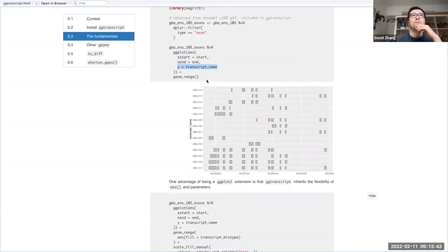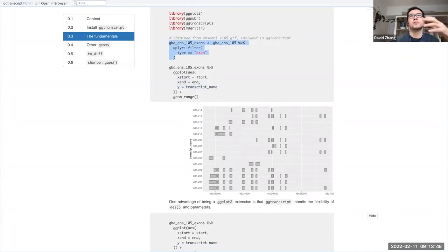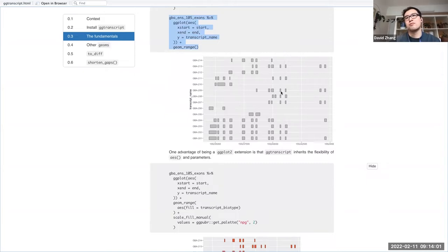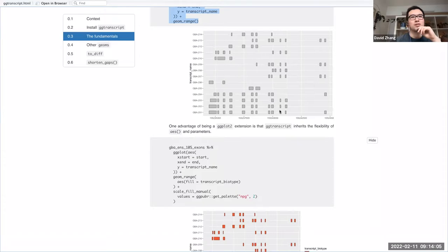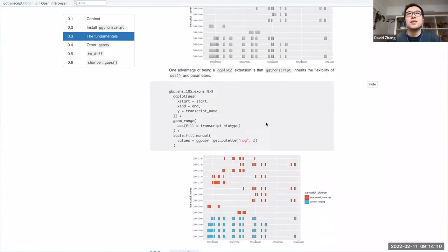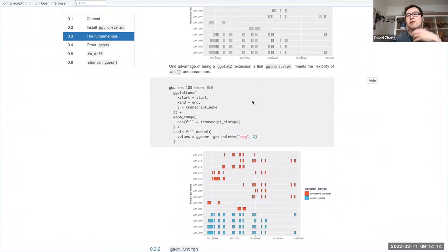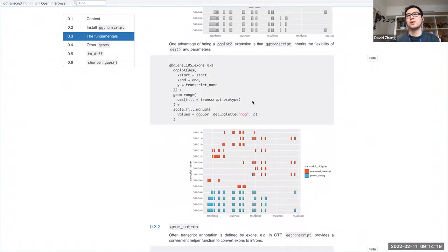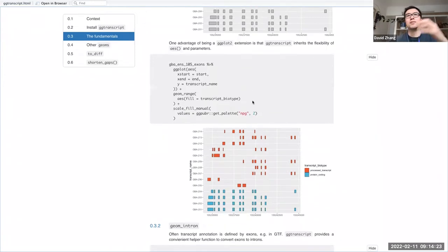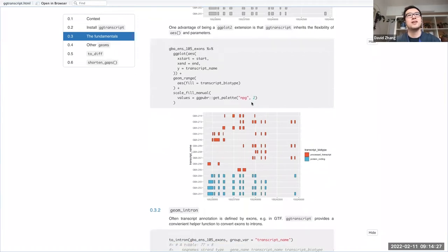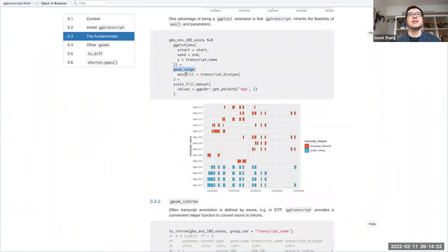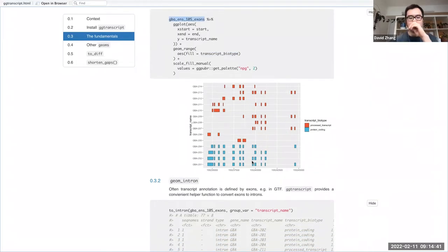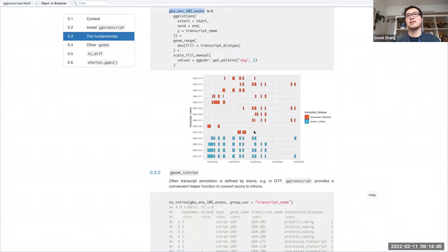In reality, geom_range is just geom_tile, but instead of being parameterized by x_min, x_max and y_min, y_max, you have an x start and end to match genomic nomenclature, and a single Y that can be a discrete value such as a transcript name. This is an import of a GTF object filtered by exons and converted to a data frame. Dropping this into traditional GG Plot syntax gives you ranges that look like a transcript annotation plot. One key advantage is it inherits all traditional GG Plot syntax and flexibility of aesthetics. For example, setting fill to transcript biotype gives you the aesthetic functionality you'd expect.